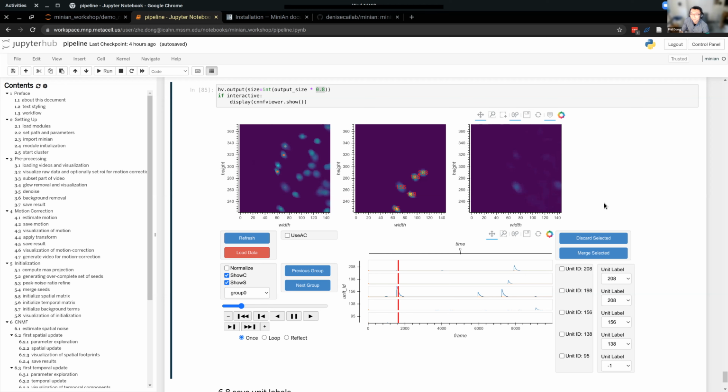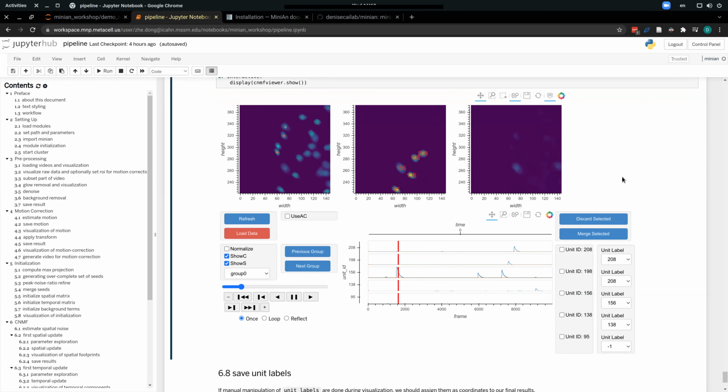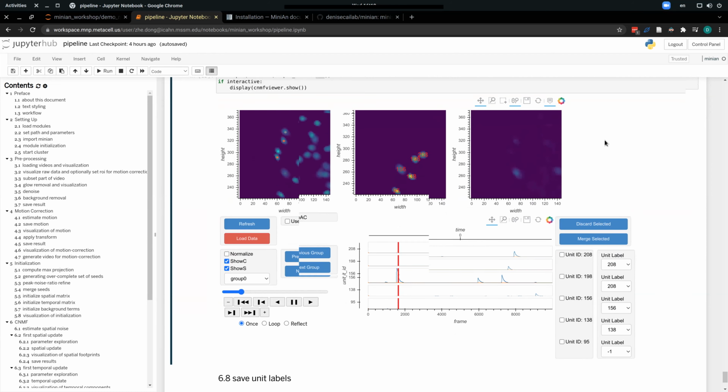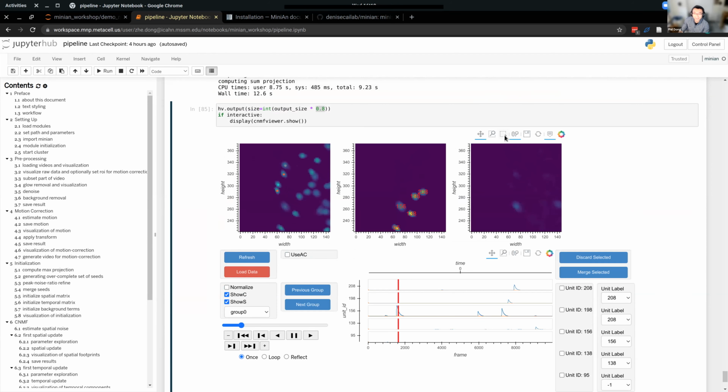Something's not working. It worked for me, when I draw it, the screen got updated. Right now I just drew some random box, and the second and third boxes got updated. Oh, I'm glad it works for someone.